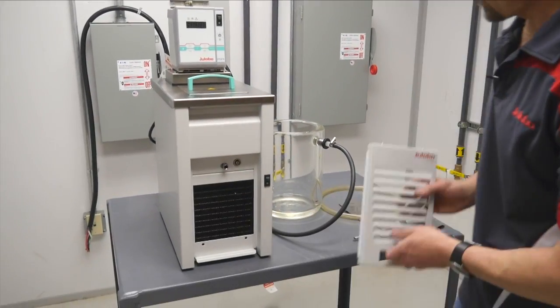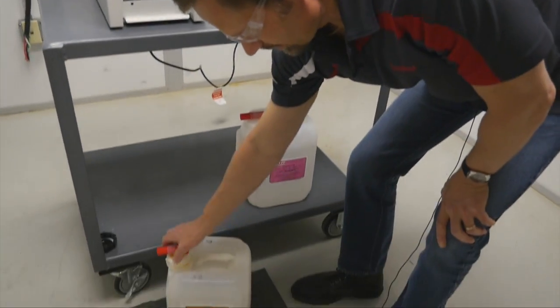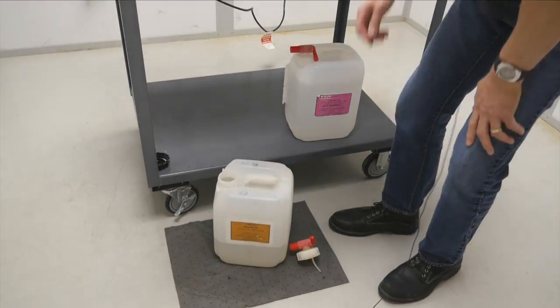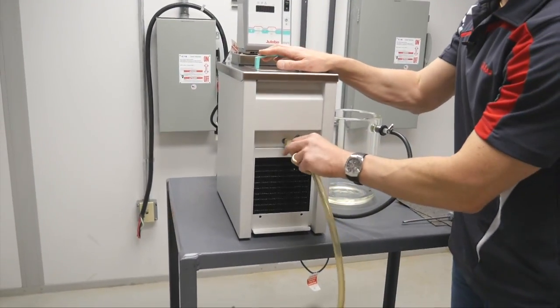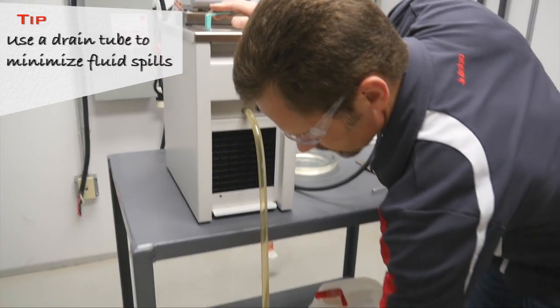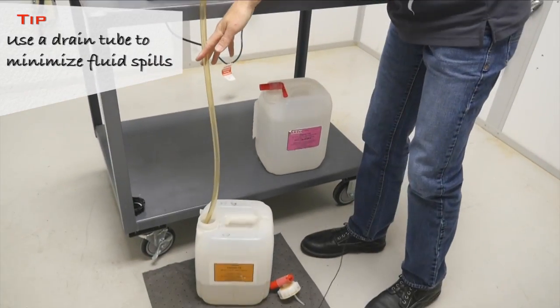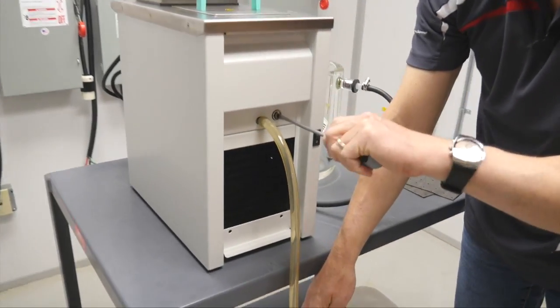Simply remove the front grid, grab a receiving container, then install a drain tube on the drain port. Using a screwdriver, open the drain valve.